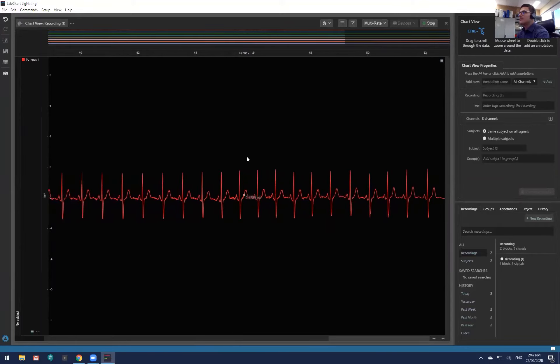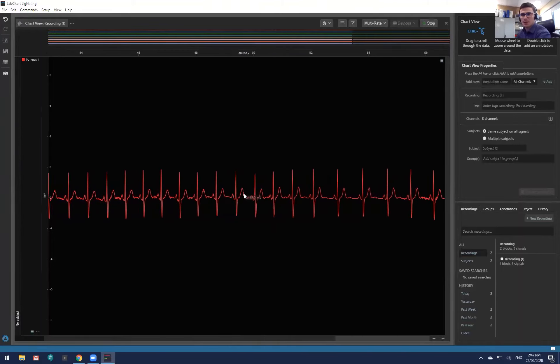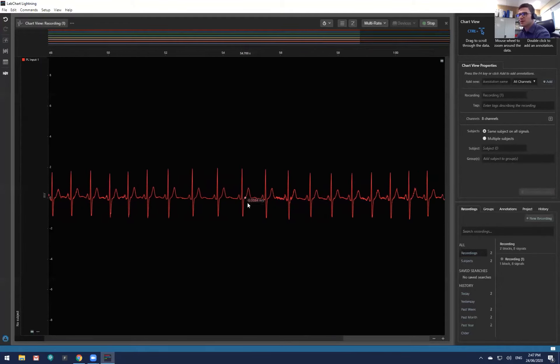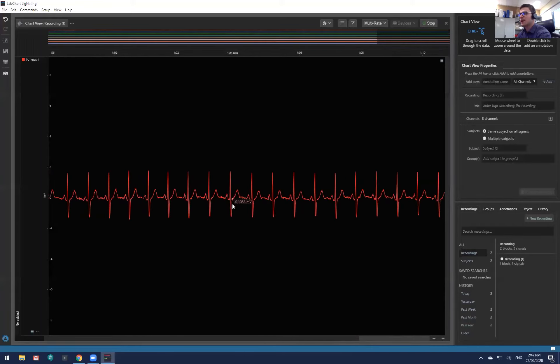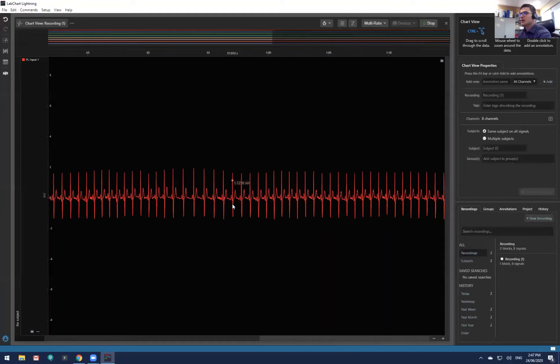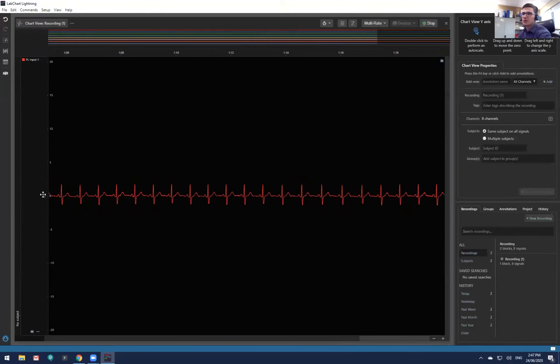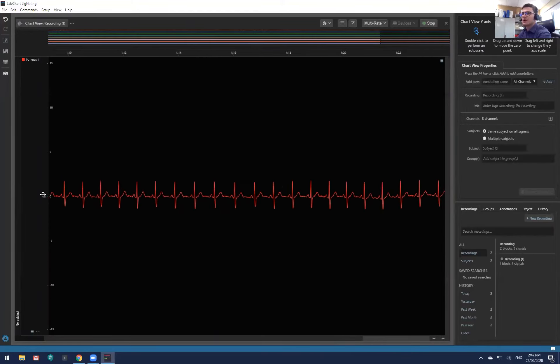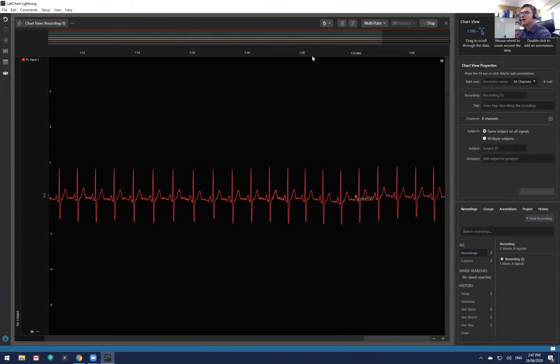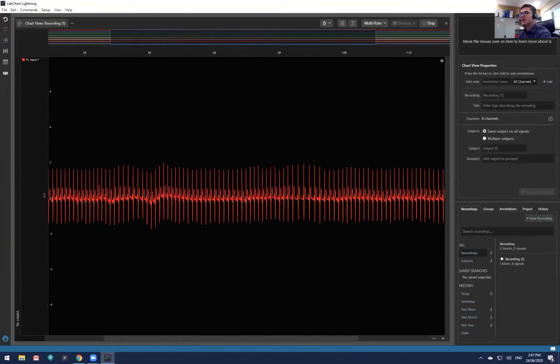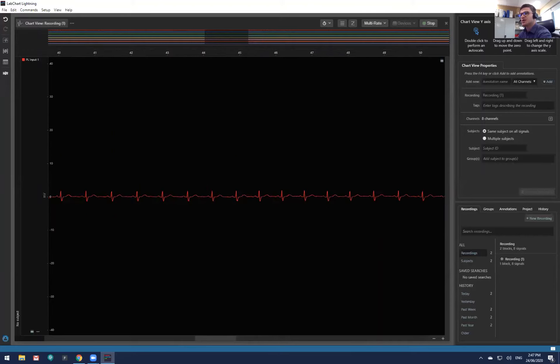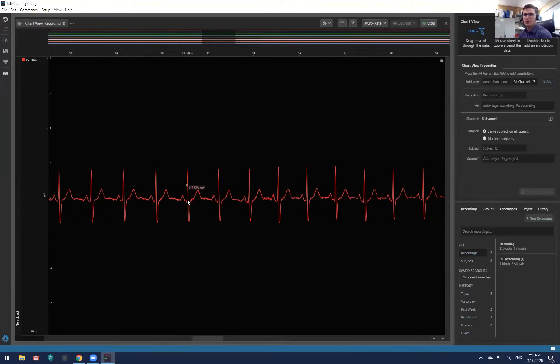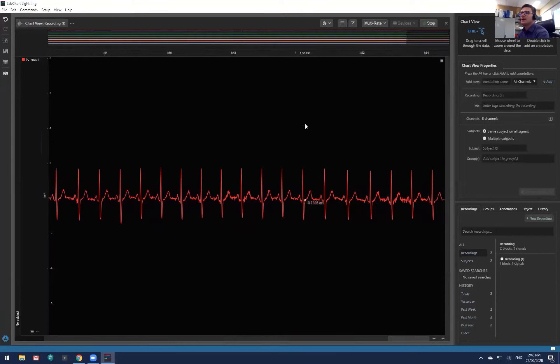You can use your scroll wheel on your mouse to zoom in and out of the signal. You can also move your cursor over the scale and scroll in and out to change the scale. Alternatively, left-click and hold on the overview and move your mouse up and down to zoom in and out. Left-click and drag on the scale left-to-right to change it. There's plenty of flexibility in how you view data, without having to manually enter plus/minus values as in LabChart 8.